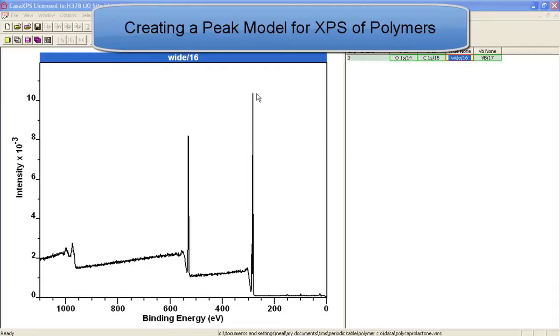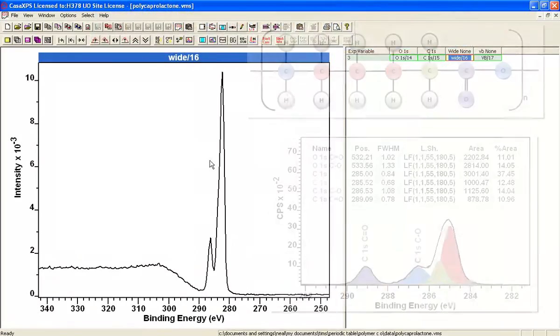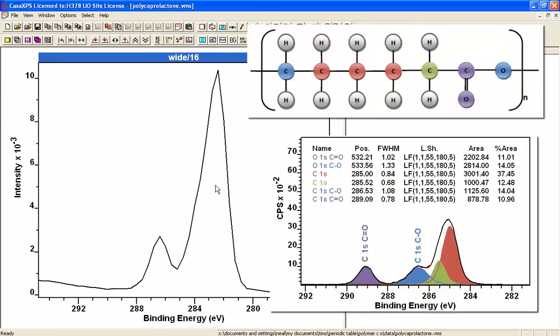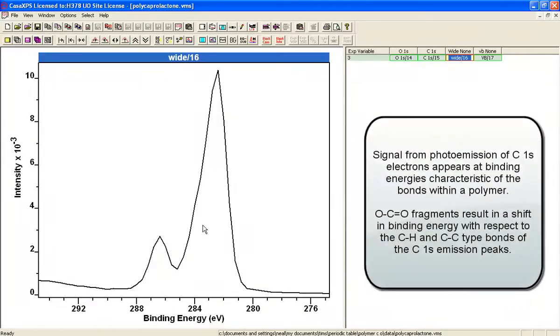One of the significant advantages of XPS is its ability to see chemical state information within data. I've just zoomed in on a survey spectrum to the carbon 1s peak and you can see that you have structure here and this structure reflects the chemistry within this material.